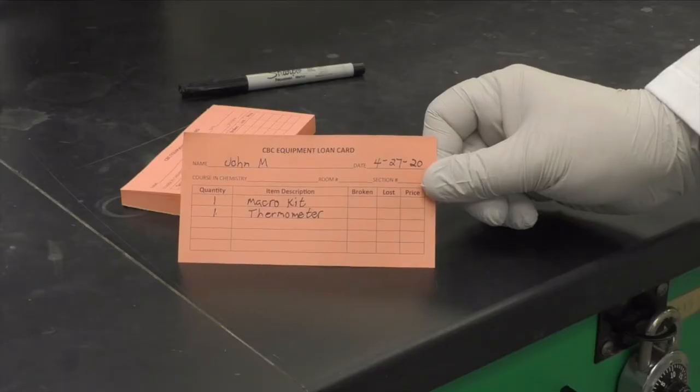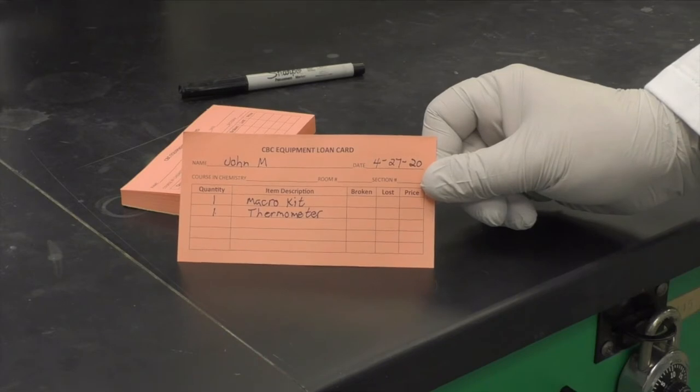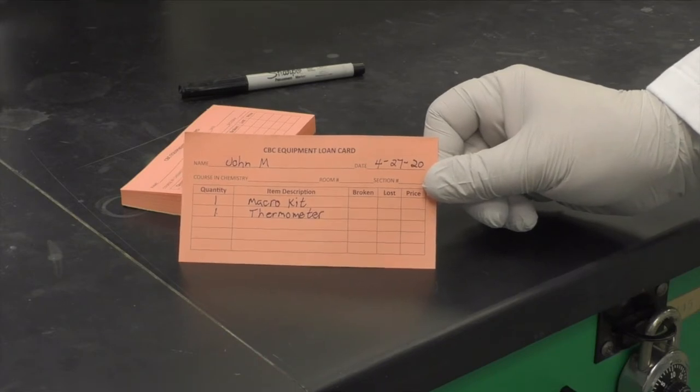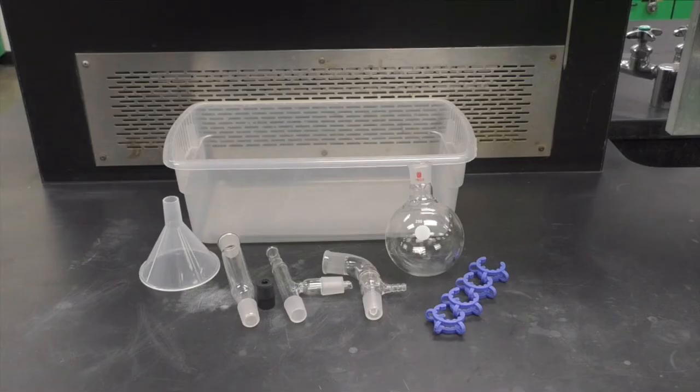To start, check out a macro kit and thermometer from the ILSG window. Your kit will contain a powder funnel, a 250 milliliter round bottom flask, a fractionation column, a three-way connector, a thermometer adapter, a vacuum adapter, and four blue clamps commonly called Keck clips.